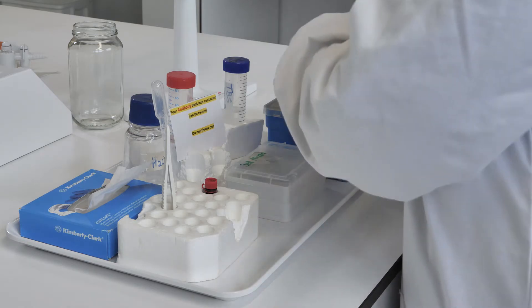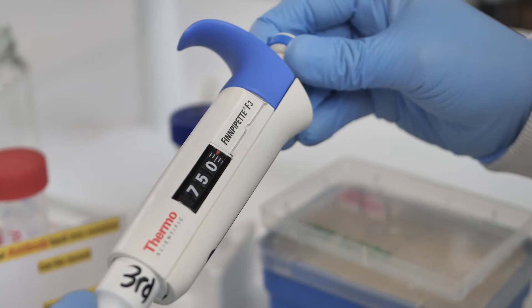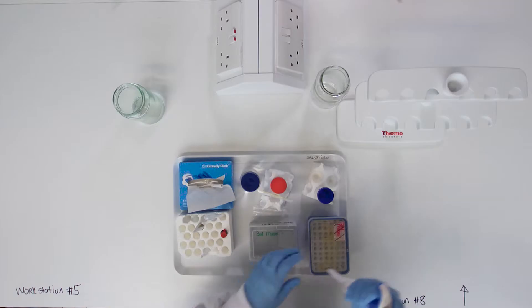Now pipette 750 microliters of TMB substrate over the surface of the membrane.